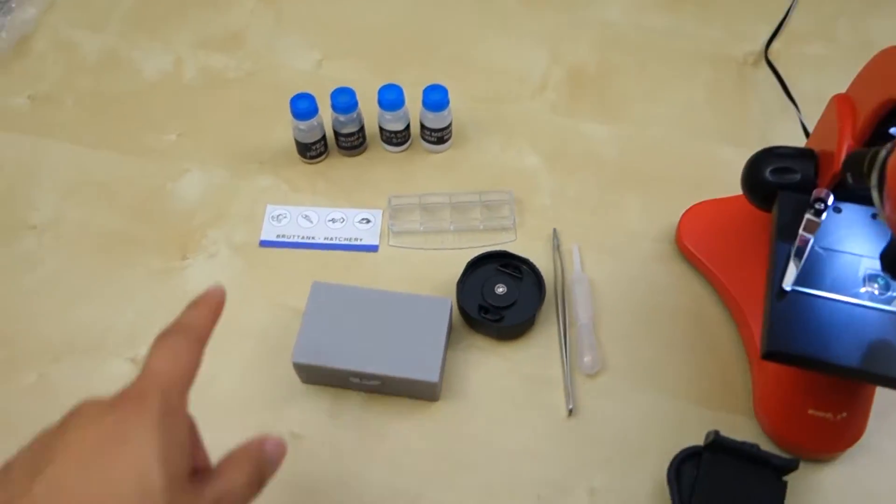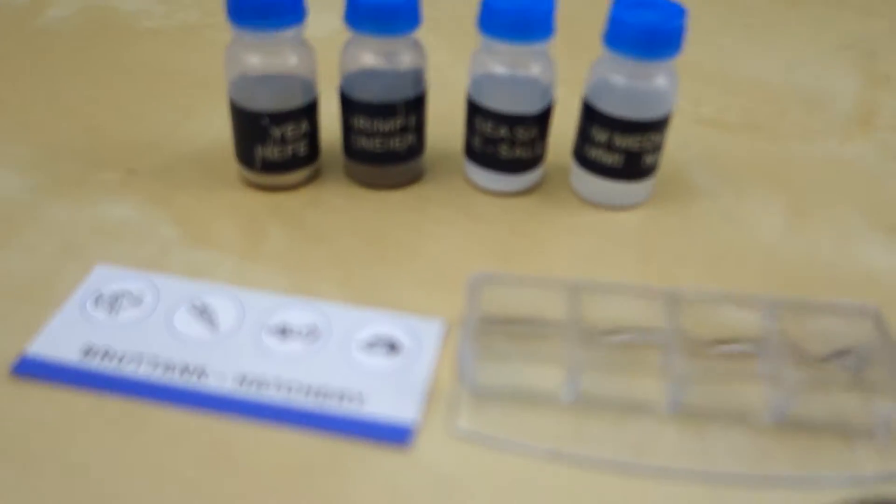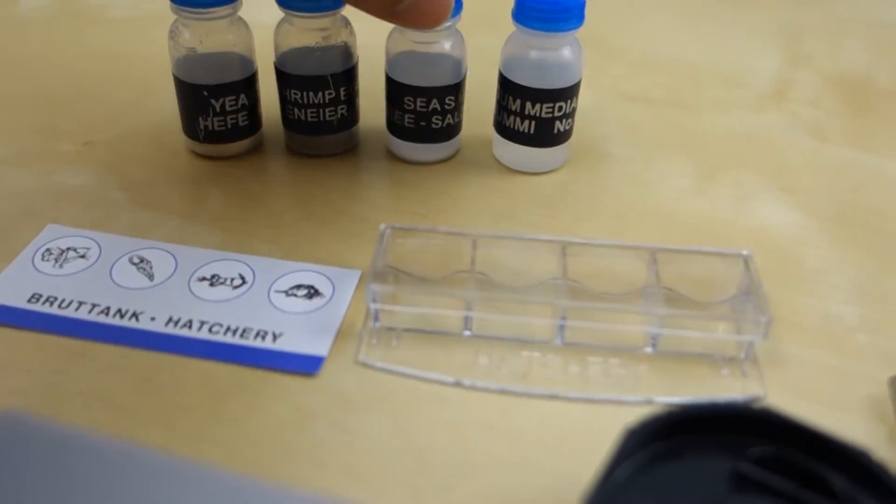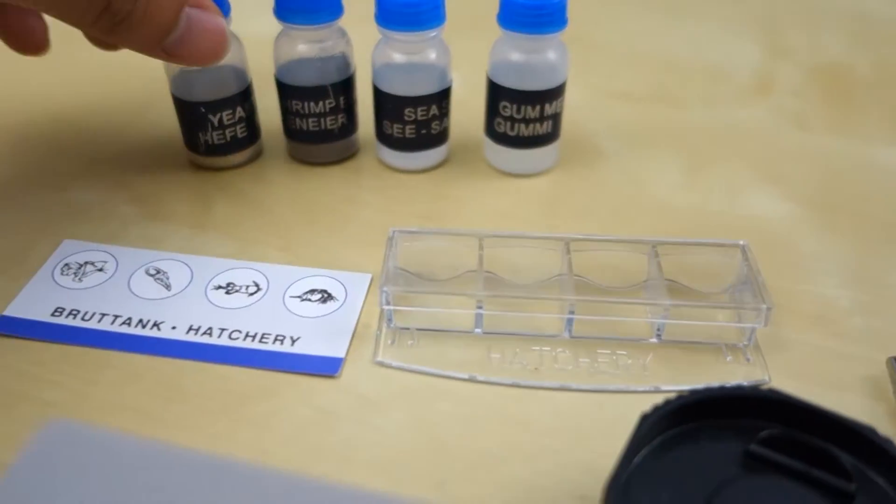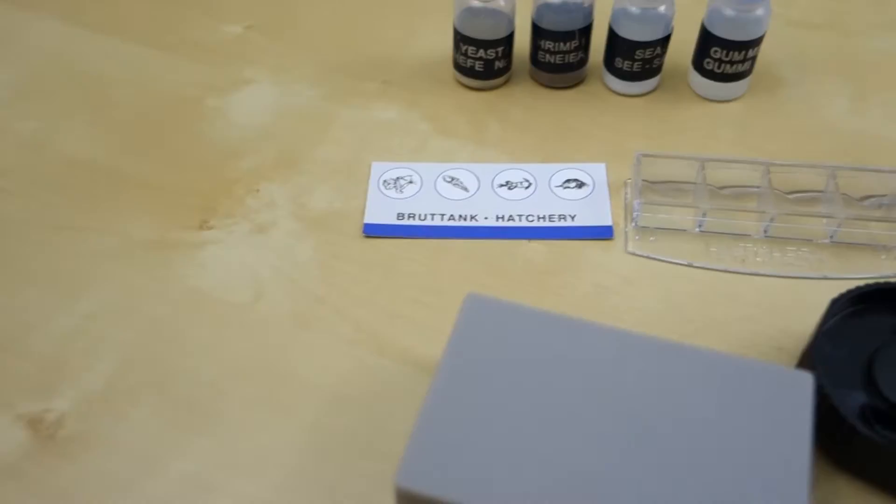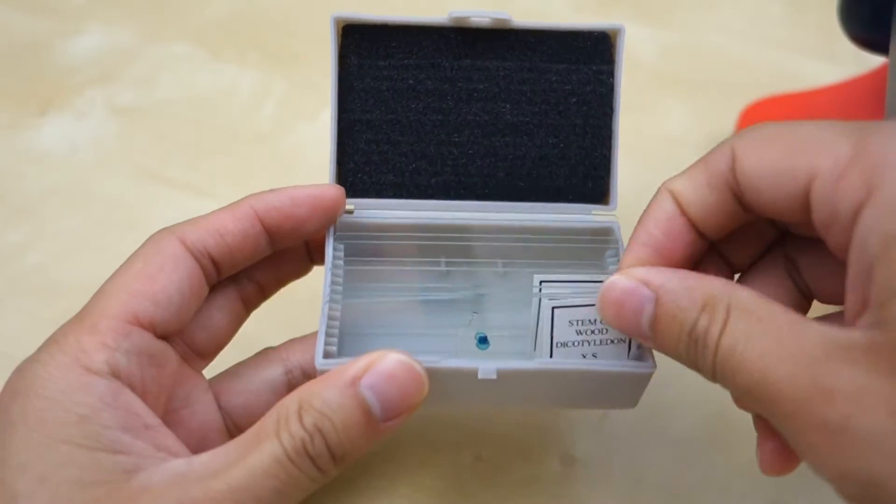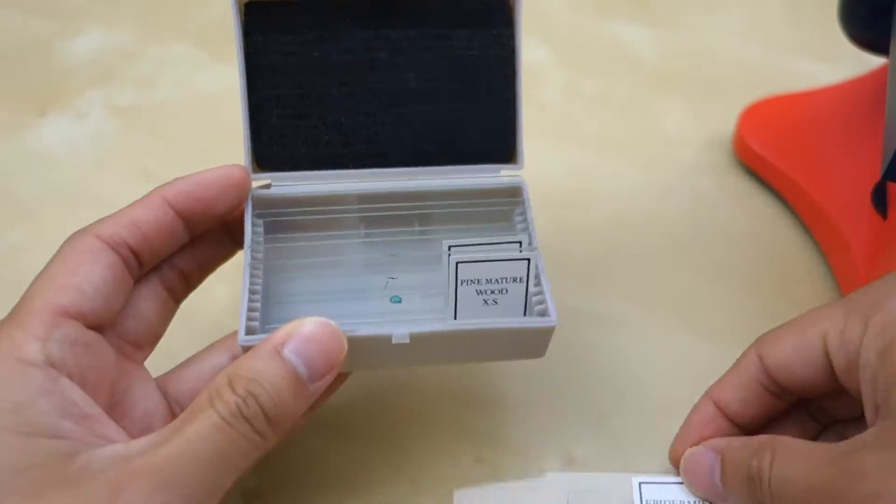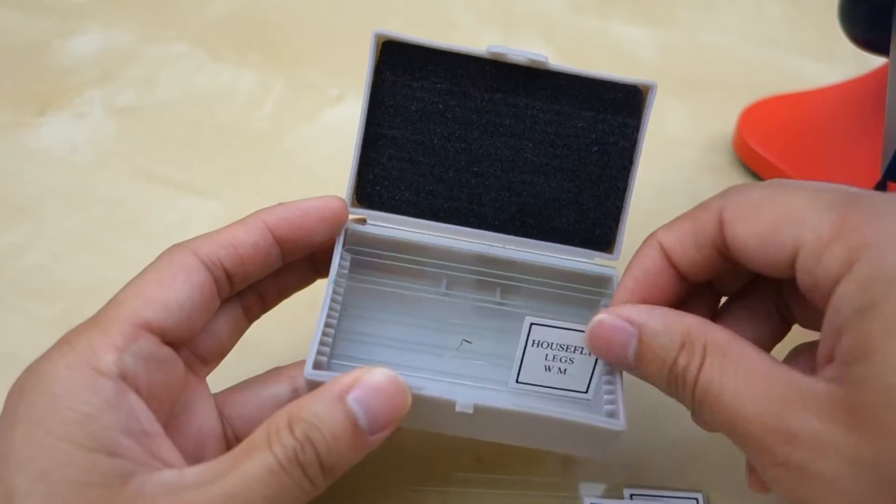And then it comes with some samples here for some of the egg like shrimp, sea salt, you got stuff like yeast. So these are some of the live stuff that you can hatch and then see it under the microscope. You have here a box of different slides and then it also has empty glass slides that you can put your stuff on.